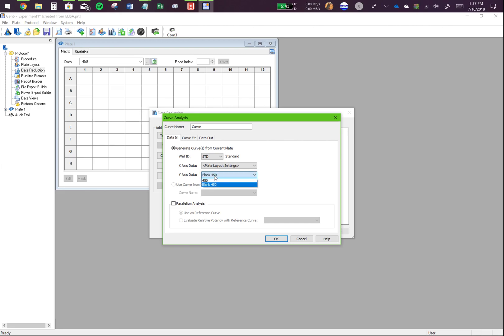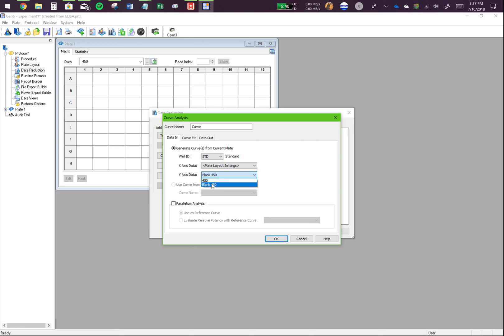I want you to know that you should select blank 450 and not just 450 because blank 450 is the absorbance at 450 subtracted by the blank. So this is your absorbance minus the background noise, and this is the right way to do it.